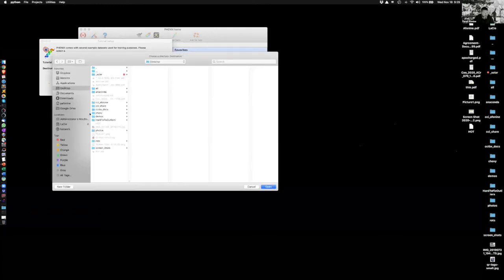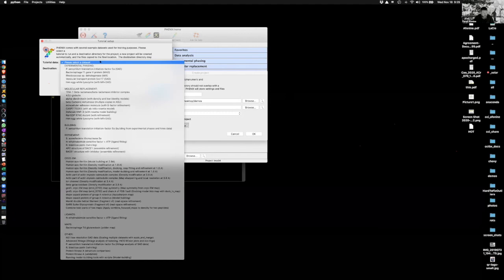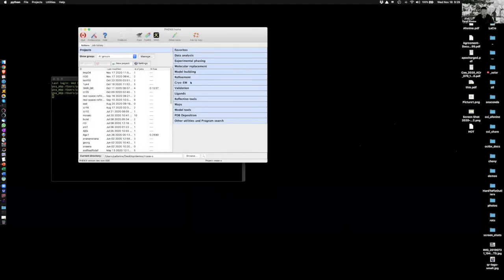Define where I want to run them. And the one I'm going to run is in Refinement, the first one, the easiest one to run. And I say, okay.